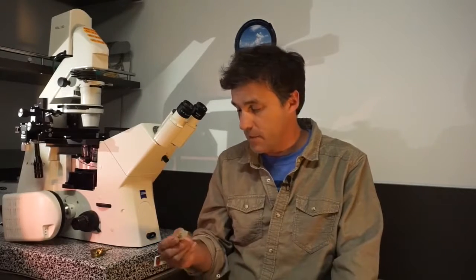And if you look at my webpage, you'll see there's written instructions for making your own microscope, and they actually carry on to show you how to use a laser to determine the magnification of the lens that you made. So anyway, I hope that was interesting and informative, and I hope you get a chance to try this yourself.